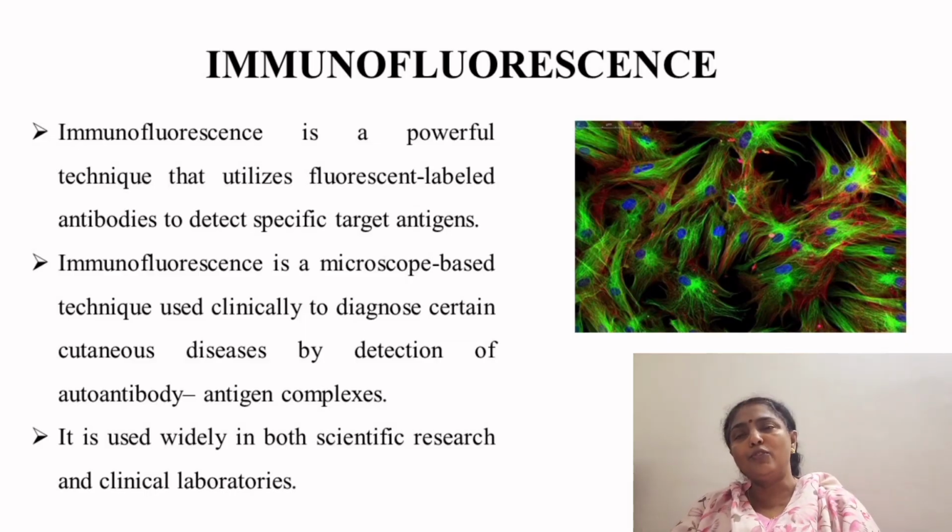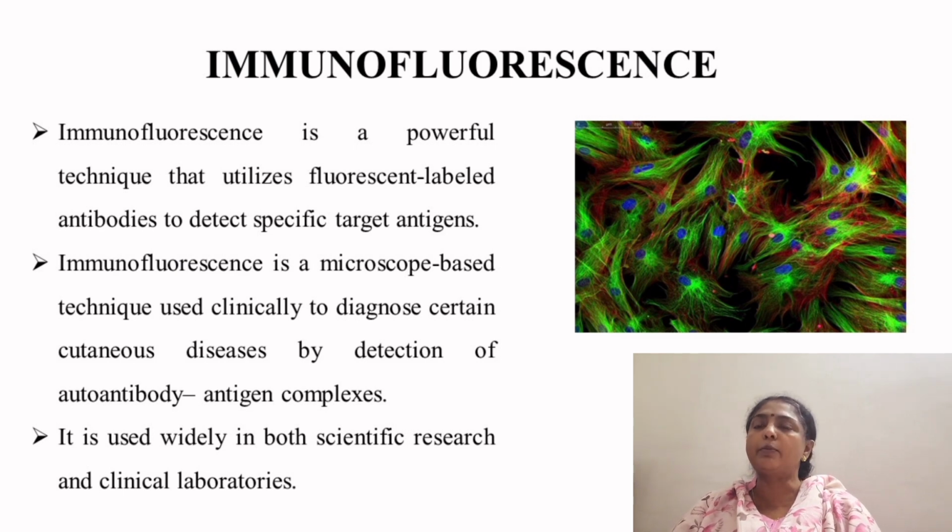I'm here today to explain and demonstrate another important experiment of Cancer Genetics Laboratory, Immunofluorescence assay of cancer biomarkers. Immunofluorescence is a powerful technique in biology and it is used to detect specific proteins or antigens in biological samples. The biological samples can be tissues or cells. Immunofluorescence relies on specific antibodies which are used to detect specific proteins which are present in the cells using fluorescence microscopy.